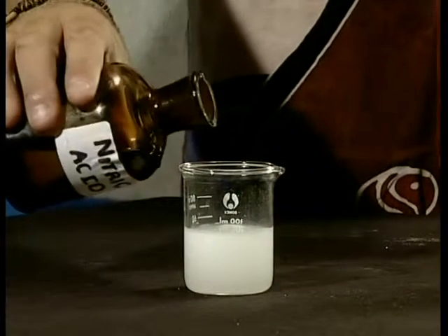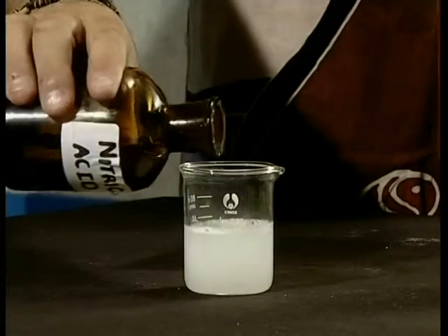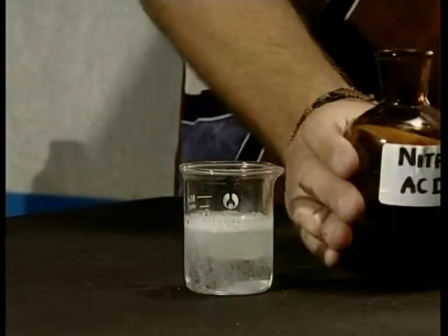Now, when acid is added to any carbonate, it produces bubbles of carbon dioxide gas. The carbonates will dissolve in acid. That is why the second part of the halide test is so important. We need to test whether the precipitate will react with the acid to distinguish between the halide and the carbonate.